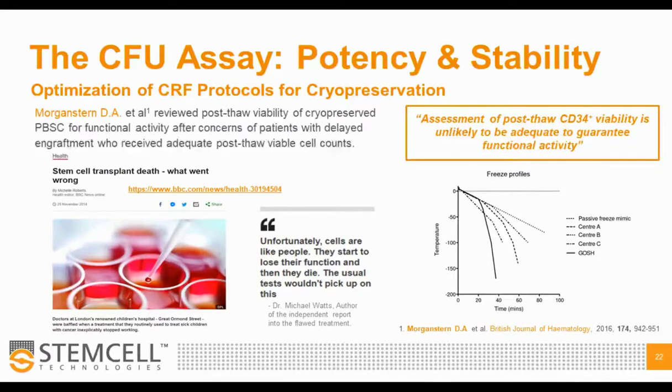So there was actually an investigation that was started because of this, and this outlines what happened as far as the BBC news that came out on this incident. And Dr. Mike Watts, again, was involved in investigating this and did an independent investigation and a publication to show that the assessment of post-thaw CD34 viability is unlikely to be adequate to really guarantee functional activity.